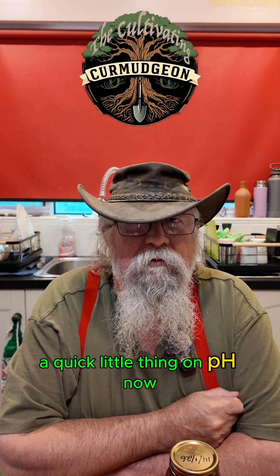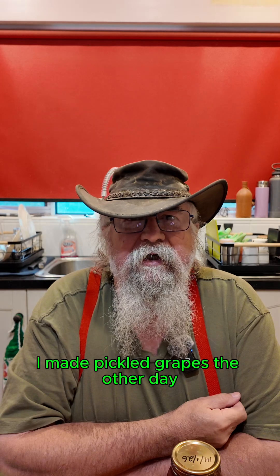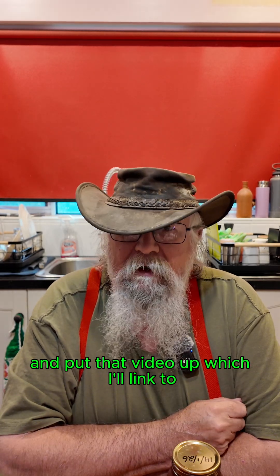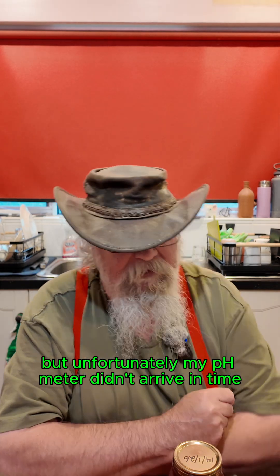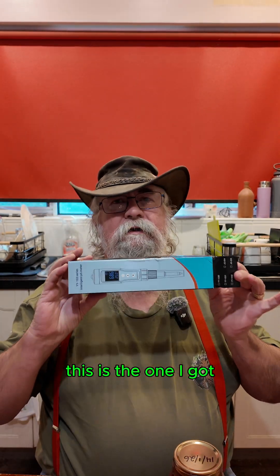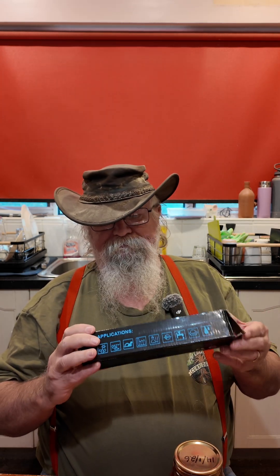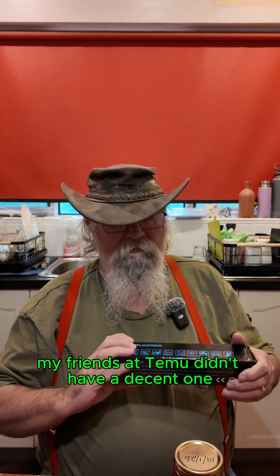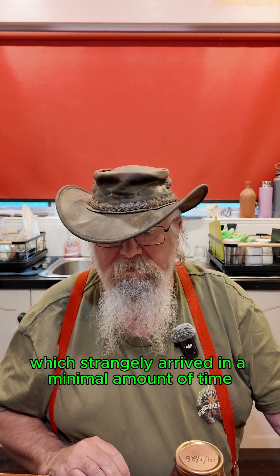G'day everyone. A quick little thing on pH. I made pickled grapes the other day and put that video up — I'll link to it — but unfortunately my pH meter didn't arrive in time. But it's here now. My friends at Tempo didn't have a decent one so I bought one from AliExpress, which strangely arrived in a minimal amount of time.